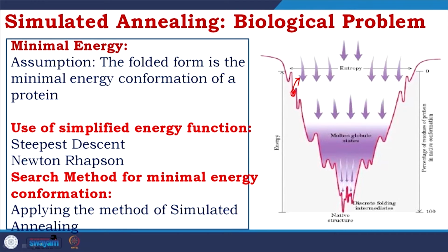First of all, it provides thermal energy, so that everything which is here, here, here, they all go up to a certain energy level. I provide heat and they are here.